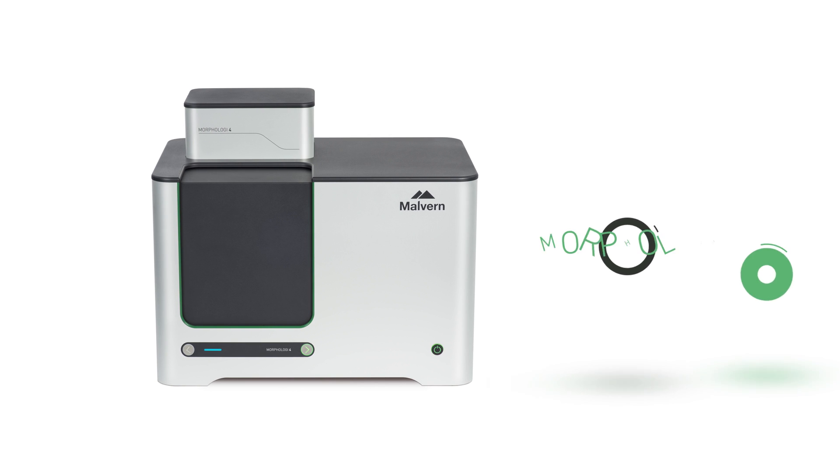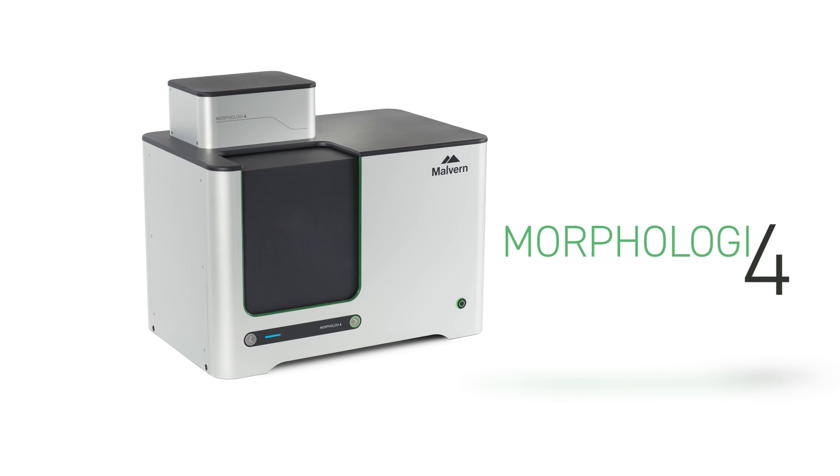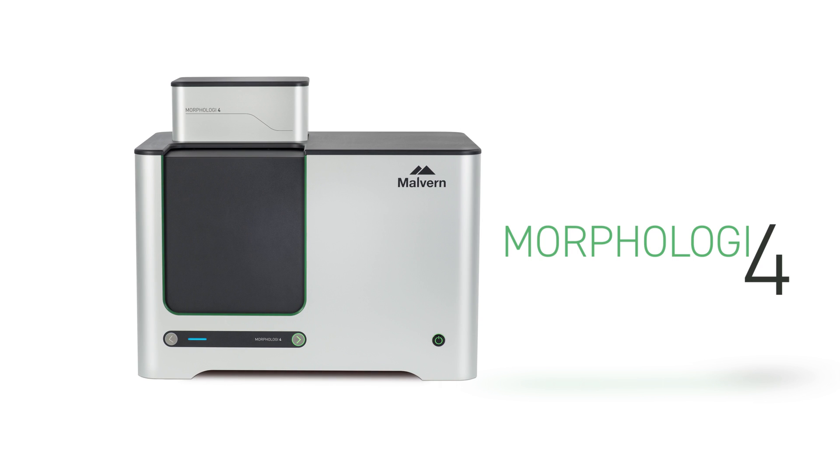The Morphology 4 is an automated image analysis instrument, providing particle size, shape, and transparency information for your sample.